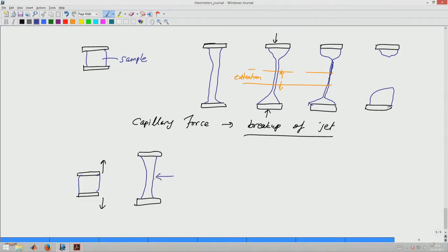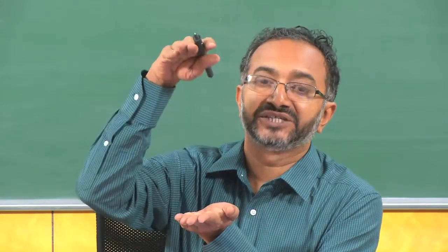I will make a measurement of how it is thinning, and based on this measurement I will again do a control and then try to change the rate of how the two plates are being moved apart. So, that there is a control on. If you remember when we looked at the overall extensional flow problem, the position varied exponentially for us to achieve constant strain rate. So, if I do an exponential motion of the plates, I will get basically a constant strain rate in the center.